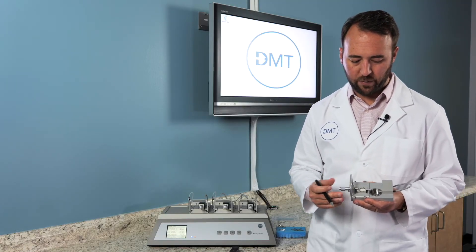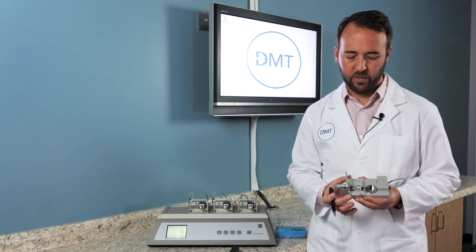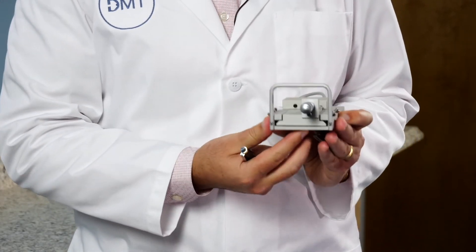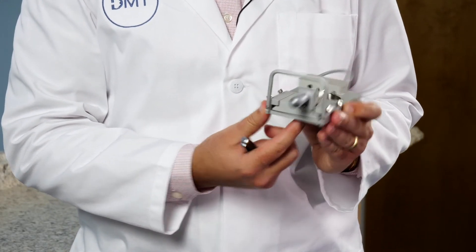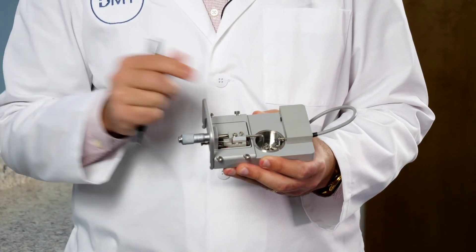As far as the fine adjustments, you have four screws on the chamber itself. Now there is a pivot point on the bottom of the chamber, where as you tighten these screws, you are tightening around that pivot point.